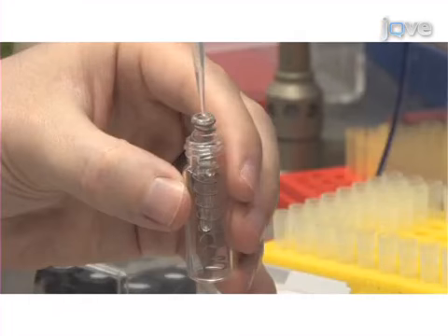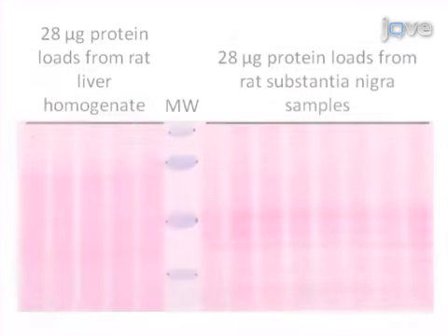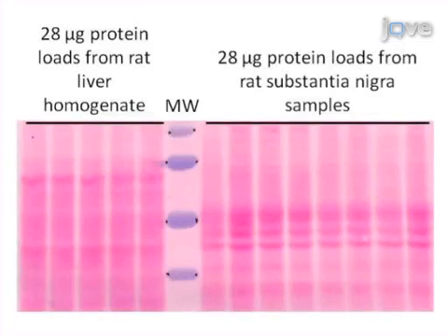The second step is to process the tissues for the analysis of dopamine by HPLC and further processing of the precipitated endogenous protein for analysis. Next, the processing of the precipitated protein for total protein content allows the determination of which dopamine-regulating proteins, or protein phosphorylation, can be measured in conjunction with the readout of dopamine tissue content in the sample.